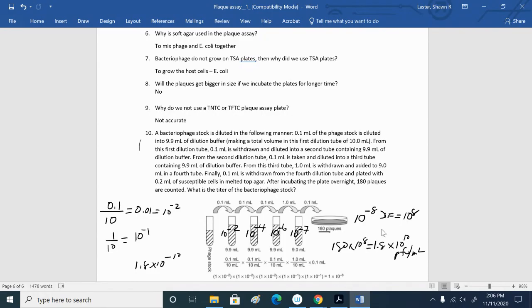What would that be? It's teeny. It's like a tiny number. Yes, 0.0018, 0.00000, and so on. So it's a teeny tiny fraction of 1. And that kind of answer makes no sense, right? Because we're calculating the numbers of viruses, so it has to be a whole number. It can't be less than 1.